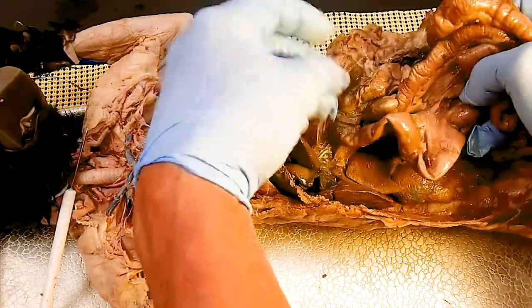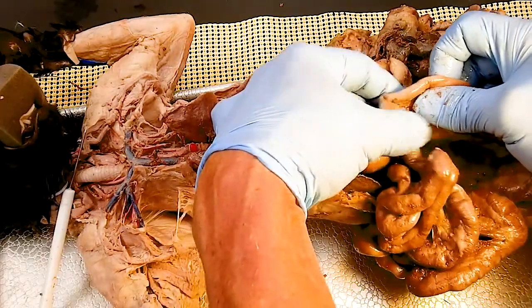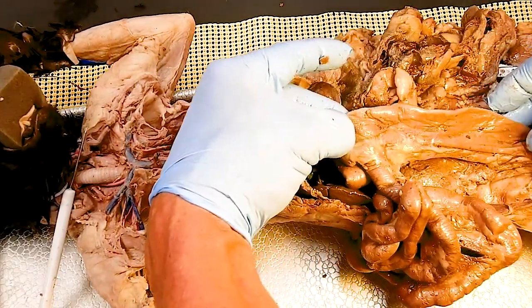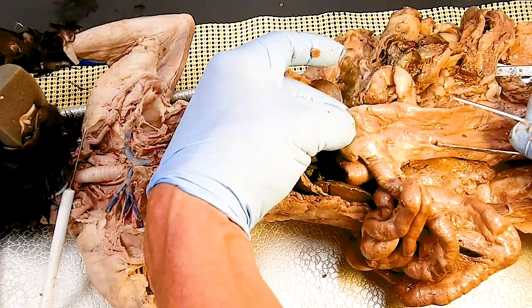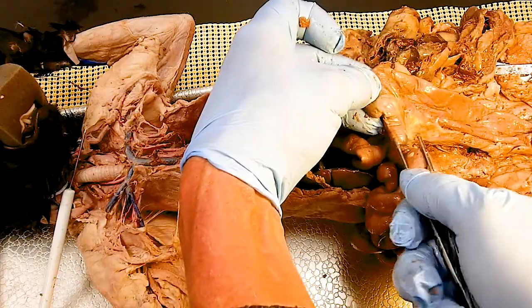And the small intestine goes until you reach the colon. This is the colon or large intestine. It's quite a bit shorter. It's just larger in diameter. So it's bigger around this way. Large intestine here, small intestine here.